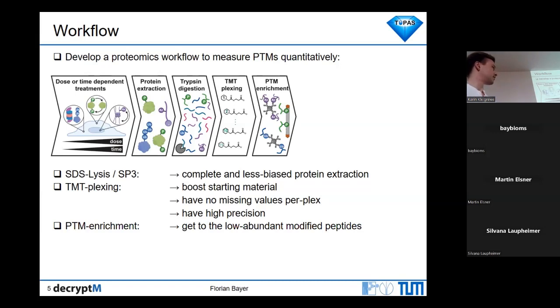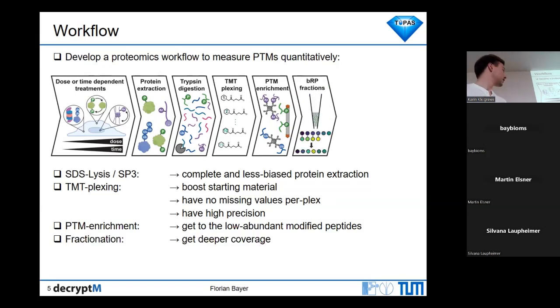Then, as I said already, PTMs are usually low abundance, so we need to do some sort of enrichment. Some people do IPs; for phosphopeptides, I use a preparative column where the phosphopeptides stick on it, and thereby we enrich the peptides we are interested in. And then, as Tina said, these TMT methods are slow because I also want to do MS3.